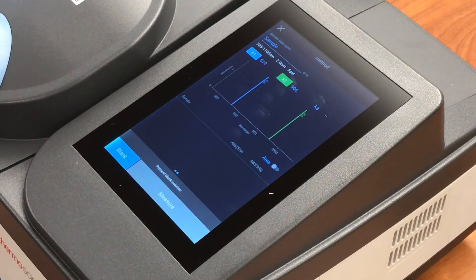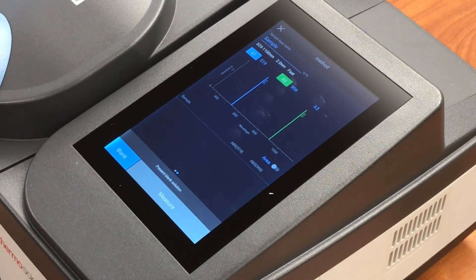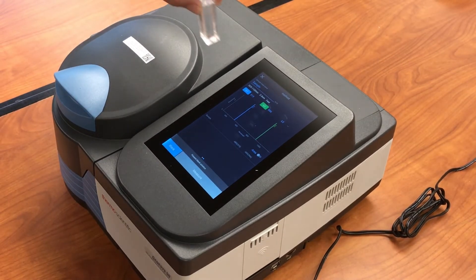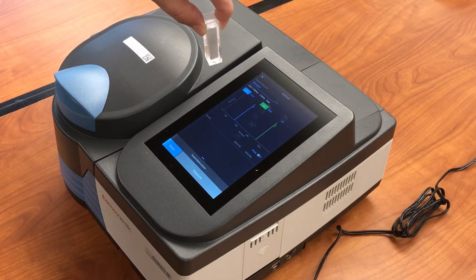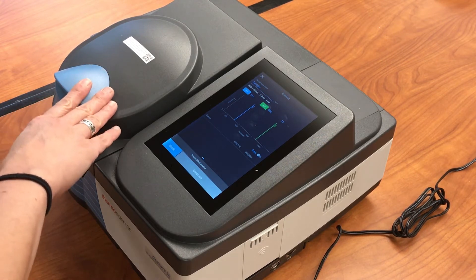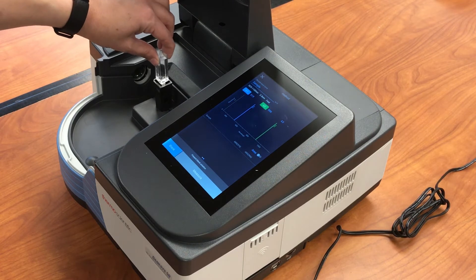Now we need to measure a blank. My solution that I'm going to measure today is a solution in water, so I am going to measure the absorbance of my blank, which will be a cuvette containing pure water. This is the sample compartment. If we open that up, you can see the cuvette holder.